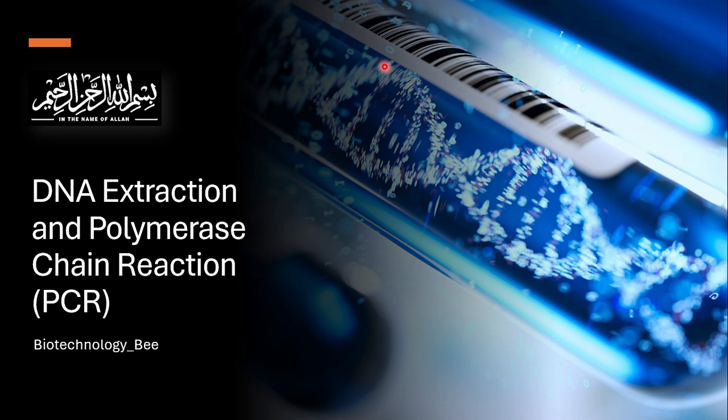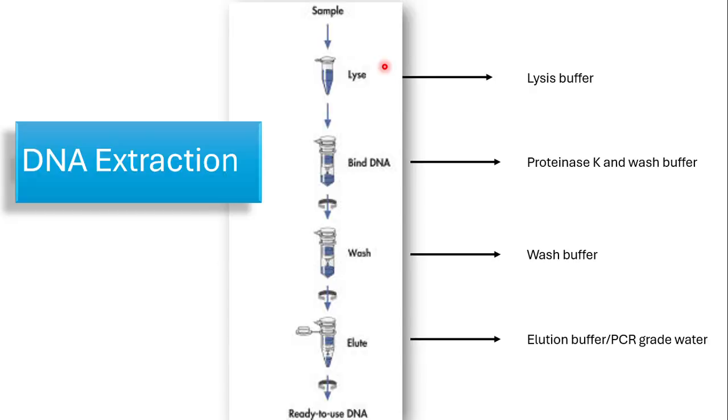So this is biotechnology B and we are going to talk about DNA extraction and polymerase chain reaction. So DNA needs to be extracted from its cell, in which it is intact inside a nuclear membrane.